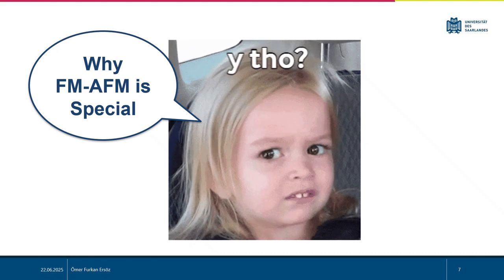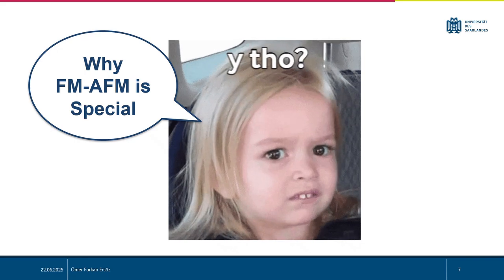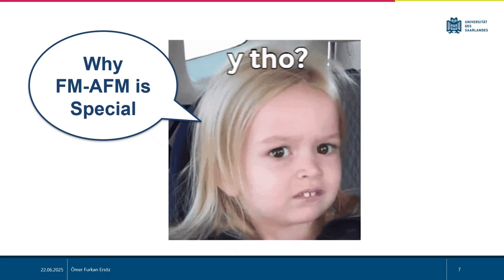So what makes FM-AFM so special compared to the other AFM techniques? Let's look at its main advantages.